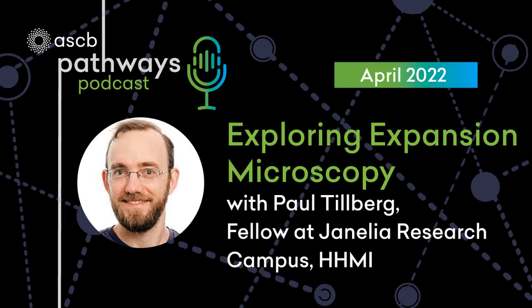Is there anything else that people should know? I guess the main thing that I would like to tell people is, firstly, try expansion. Just try it. And it's actually quite easy to get started if you just buy the chemicals, make some gels. Don't even try to put tissues in them. Just make some gels. The whole process is quite robust.